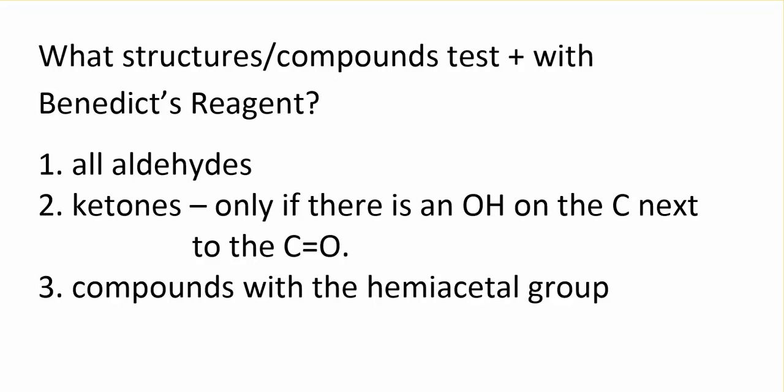We are going to be testing different sugars and carbohydrates with Benedict's reagent. Benedict's reagent is a solution that is blue, and if it changes colors to anything else, then it's a positive test. The Benedict's reagent has been reduced.